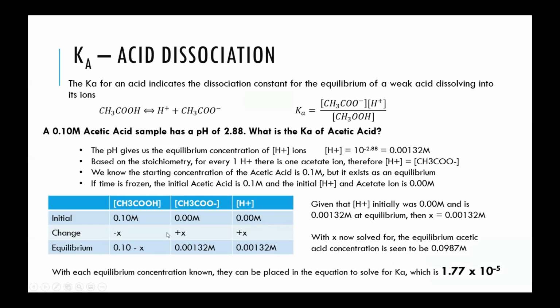So when you're trying to determine the Ka, or the equilibrium acid dissociation constant, from a sample, you need two values. You need to know the starting concentration and the pH. The pH value is a direct measurement, and this value is measuring the system at equilibrium. Typically when you're preparing these solutions in a lab setting, you're weighing out or measuring the amount of pure acetic acid, not its equilibrium amount. So this would be initial.